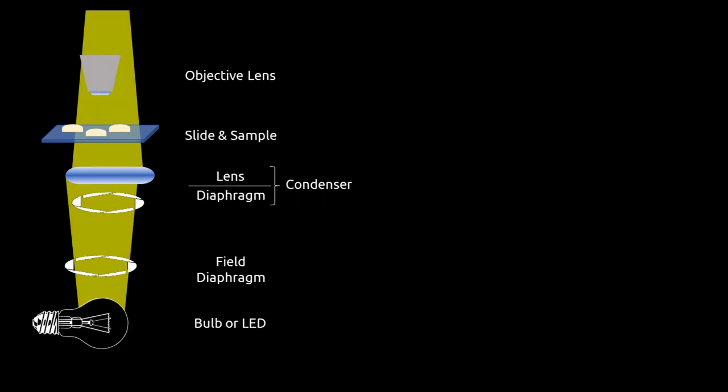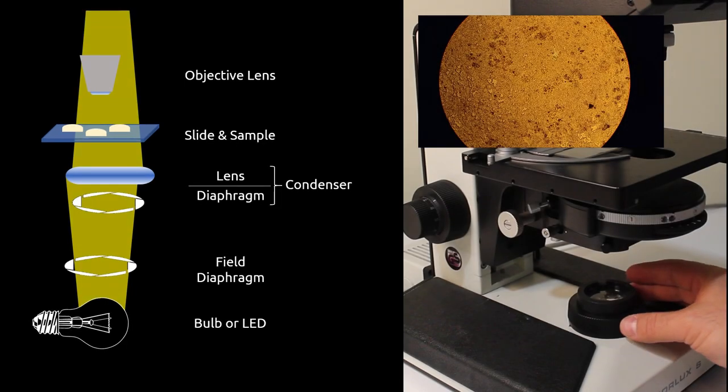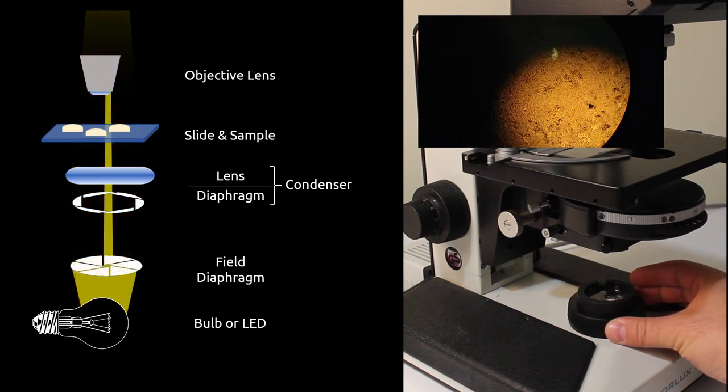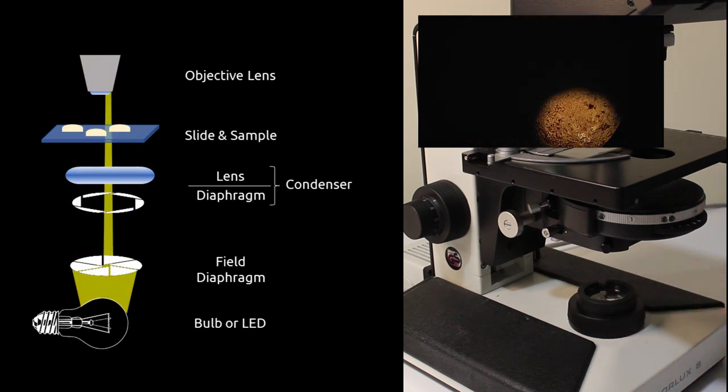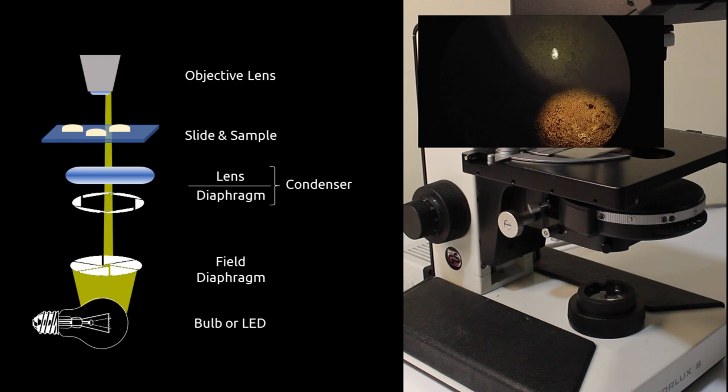The first step in focusing the condenser is to close the field diaphragm by rotating the knob around the illumination source. If your system is near alignment, a hexagon should appear in the image. If it is poorly aligned, an indistinct bright point should appear.